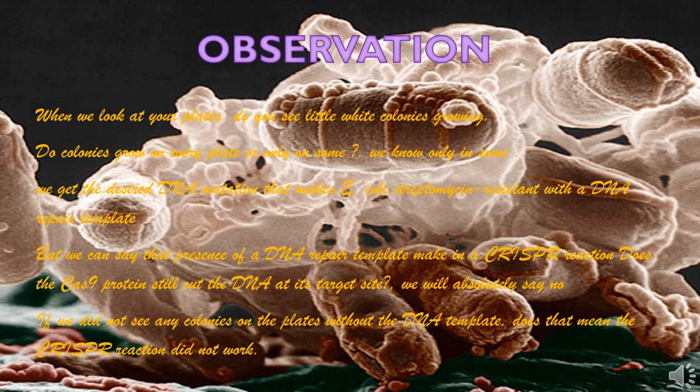Now we will analyze and interpret our results. When we look at your plates, do you see little white colonies growing? Do colonies grow on every plate or only on some? We know only in some.